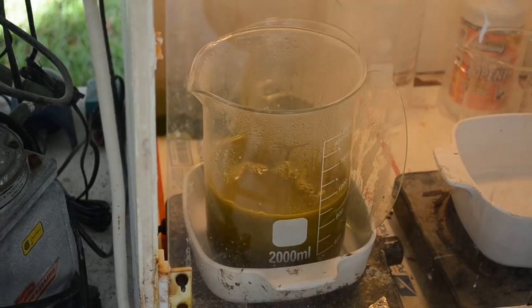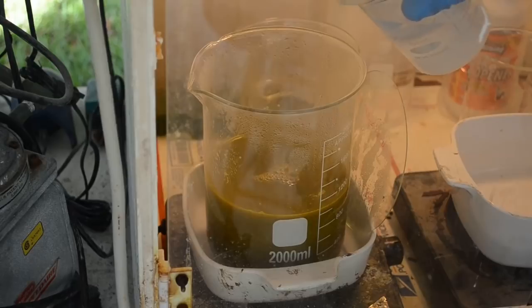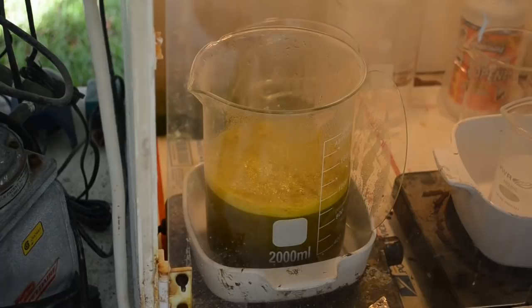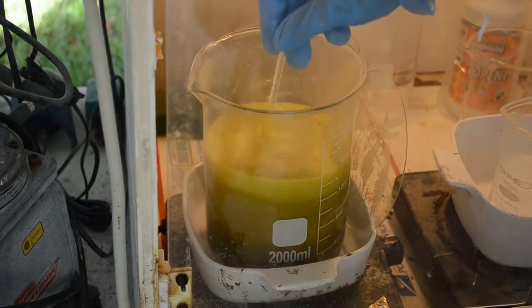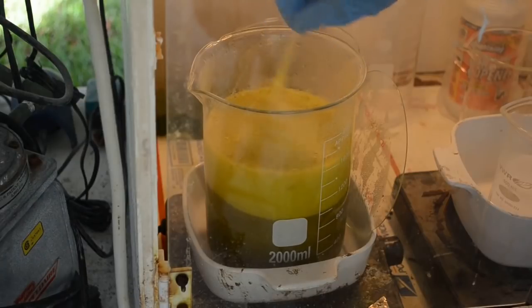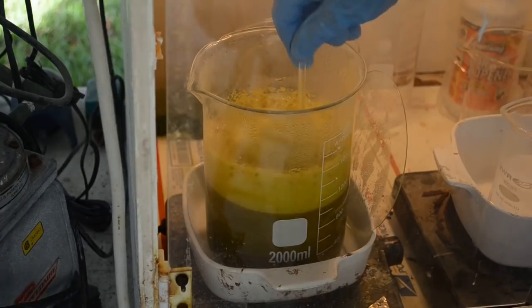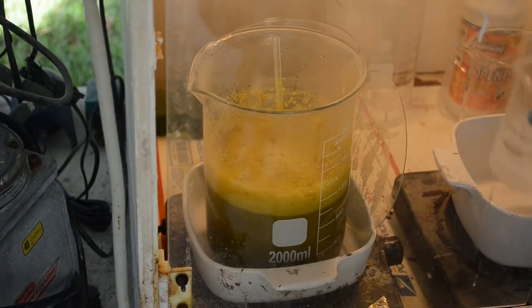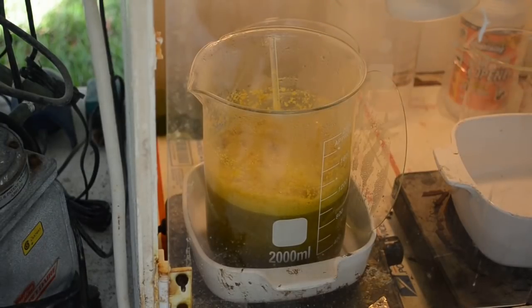So I've got my usual saturated solution of sulfamic acid here. Yeah, it's a little overnoxed. Let that settle down and hit it with some more. You gotta be careful with the sulfamic acid denoxing when there's this much paper pulp in the liquid, because it really will bubble up on you, and the paper pulp makes the foam really come up, you know? You put just a little bit more in. Not quite so vigorous a reaction that time, that's good.